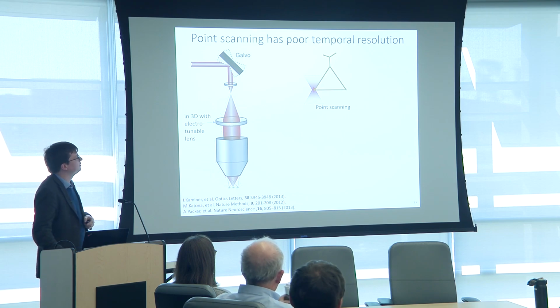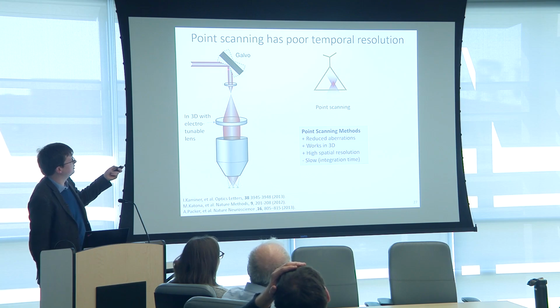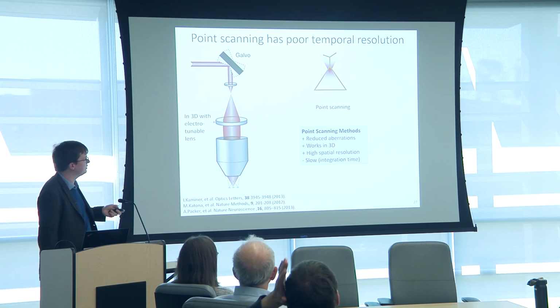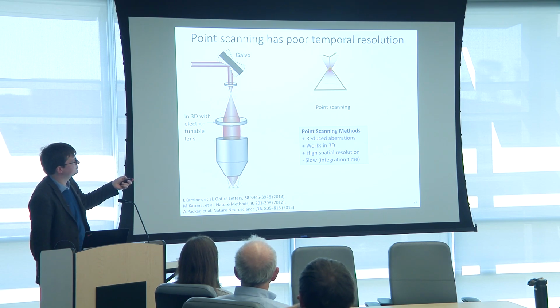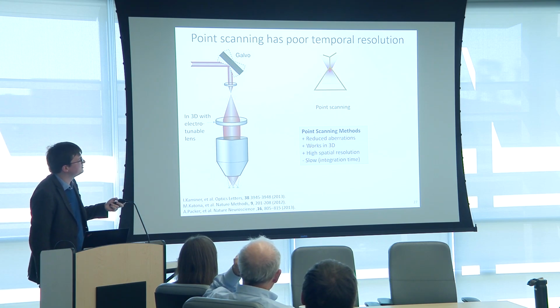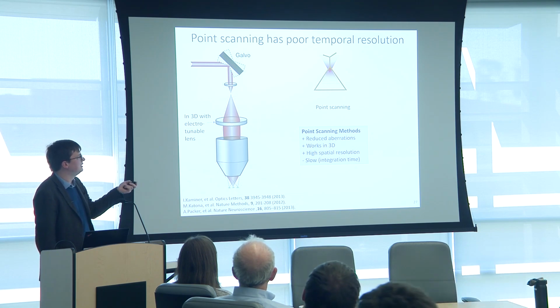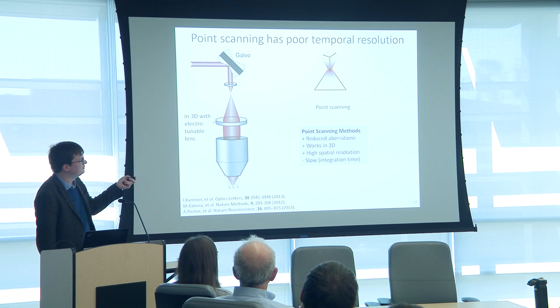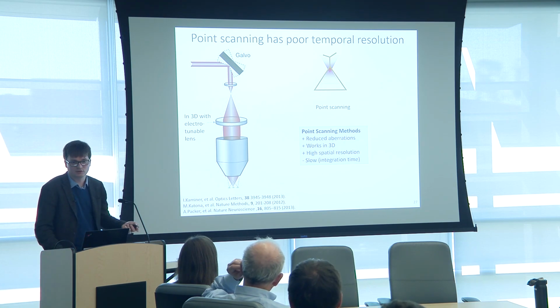So how have we gone about photostimulation? This is some of the early work on photostimulation. You can take an imaging system like the one we've seen downstairs and focus a diffraction-limited spot. And by scanning this diffraction-limited spot over the surface of your neuron, you can hope to activate all the opsin. The problem of this technique is that if you scan across a surface point by point, you time gate the activation. And what happens is that you need to integrate the effect of activation across all the opsin to create a strong photocurrent that will eventually depolarize your neuron and, for instance, trigger an action potential.